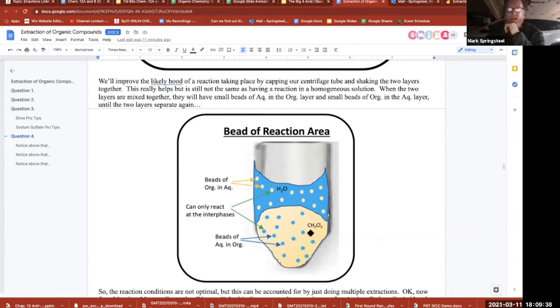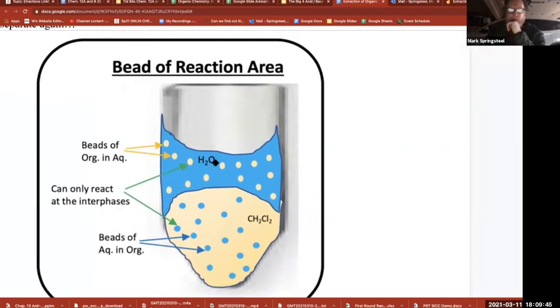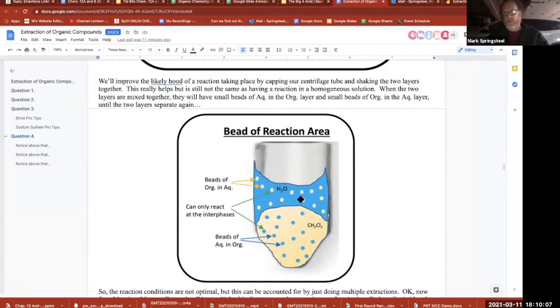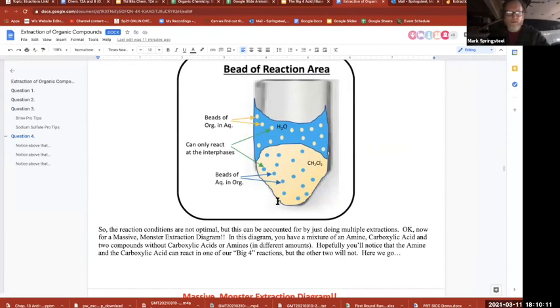when we do this, does this help our reaction? Yes. Increase. Yeah, because for instance, the water is blue. This little droplet of water has hydroxide in it, and the orange organic would have the acid. So now all the surface area around that droplet can react. So you have a lot more surface area. So usually for these kinds of things, you'll shake it a lot, let it separate out, do an extraction, and then you probably will do more than one sodium hydroxide wash in this case, because your reaction conditions aren't that great. You've got to kind of just overdo it.